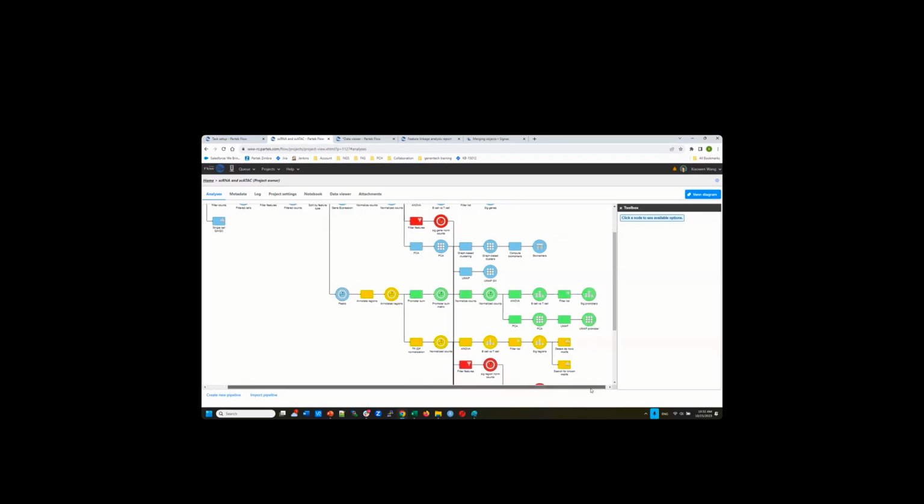Now, here we have another two options. One is, suppose you really focus on the promoter region. I don't care about all the other things, all the peaks that happened in intergenic or intronic regions. I only care about the TSS region. So we can just sum up all the reads in the promoter regions. This step is a promoter sum matrix, so we will create a matrix.